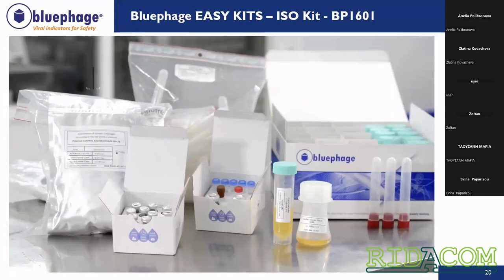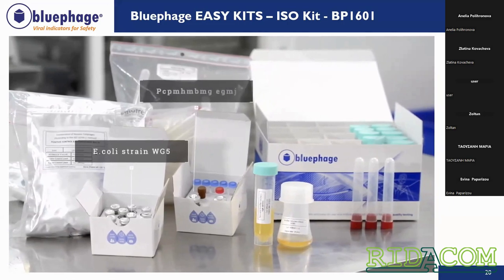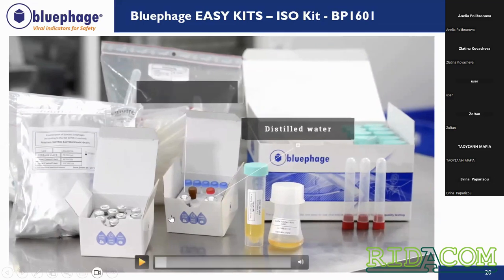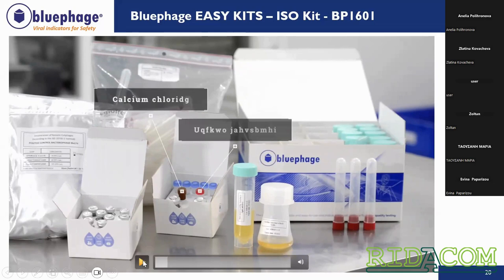The kit looks like this. We have a metallic bag with the bacteriophage and the PBS, and a box with the vials with the E. coli WG5. The nalidixic acid is used as an antibiotic to remove the interference of the bacteria that could be contained in my sample. Then the distilled water and the calcium chloride. The calcium chloride is used to improve the contact between the bacteria, the E. coli, and the bacteriophage.